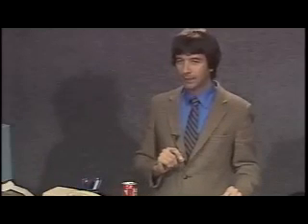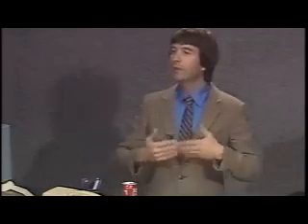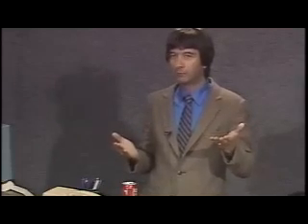Now, I'm going to show you that effect in real time by showing you another piece of a videotape. What I want you to keep in mind when I do this is that we are looking at an image with helium gas present, so we see the surface structure in atomic resolution. We're now going to raise the field, and we're going to cause the lattice to field evaporate. Now, what would you expect to happen?